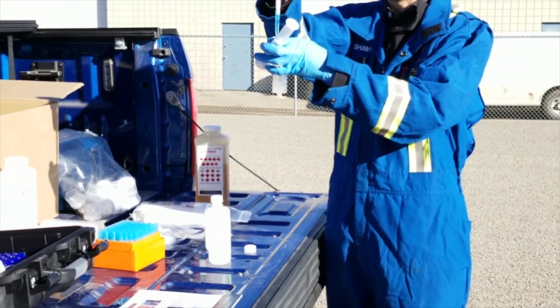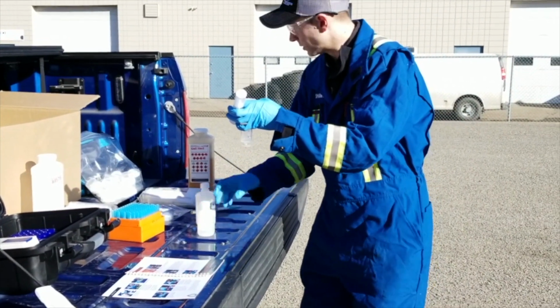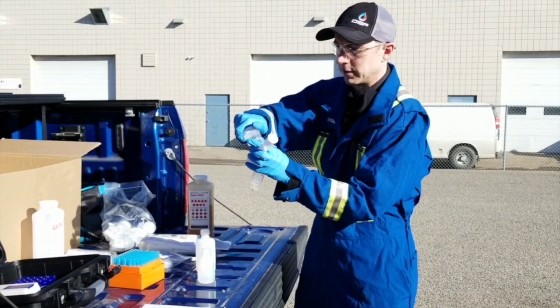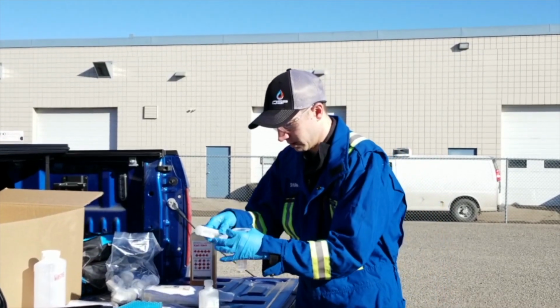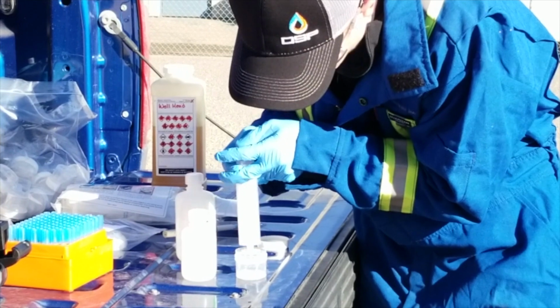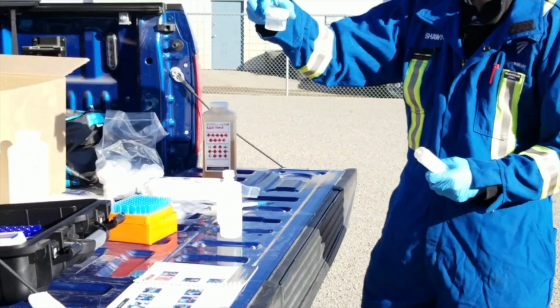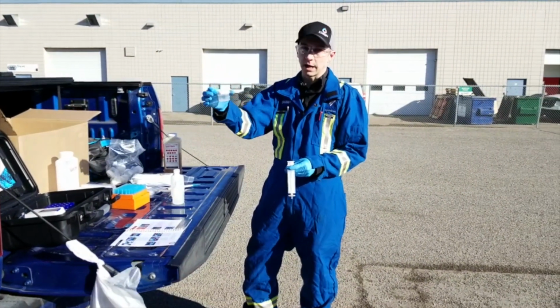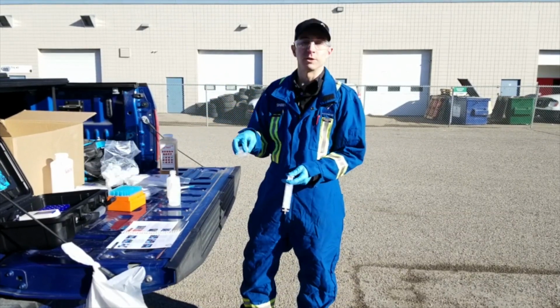Add that to your syringe with filter attached. And we're going to push this through into one of our field containers to capture and collect the extracted ATP. Again, we want to push it fully all the way through, capture all that foam. And that is now our extracted ATP. This is stable when kept in a refrigerator for up to about a week before going on with the rest of the analysis.